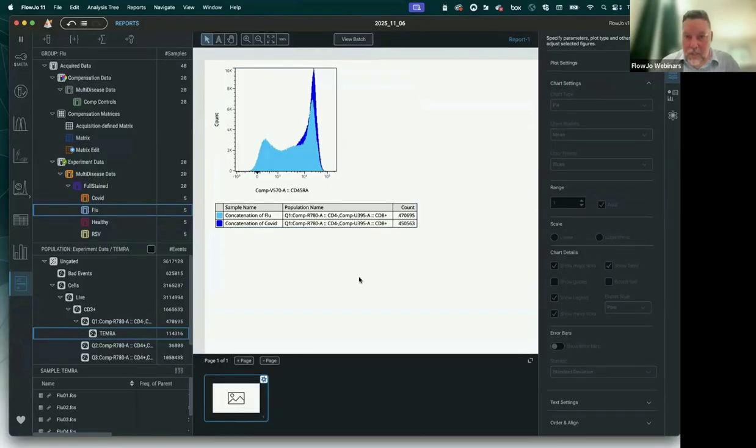I'm going to check my chat questions. What's the interest in creating keywords? Okay. Well, we cannot export the report as a PowerPoint. So what keywords, what's the interest in creating keywords?